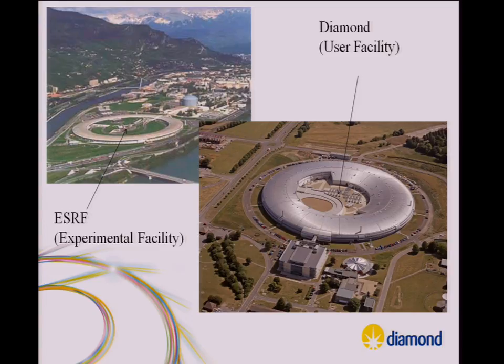Is everything done on your local computer, or do you need servers for computational methods for rendering pictures? Everything I've shown you today is just a half gigabyte download from our website, so it's just a straight Eclipse application. We do have things which use services, our supercomputer and our clusters on site, but I haven't shown you those today because they won't work unless I'm on site. Some of them will, you can SSH in, but in general.